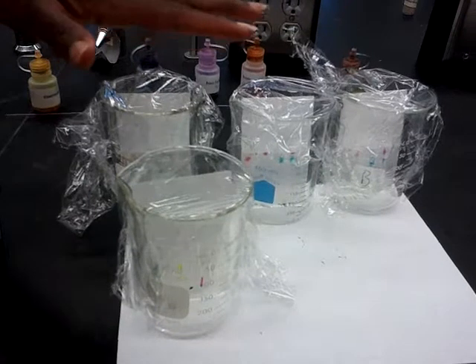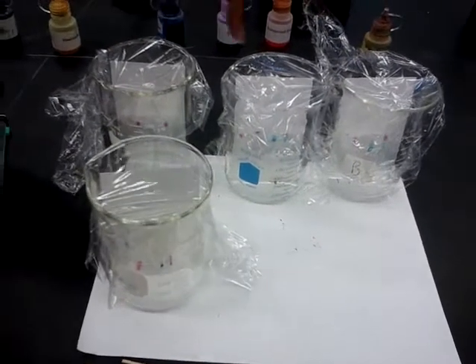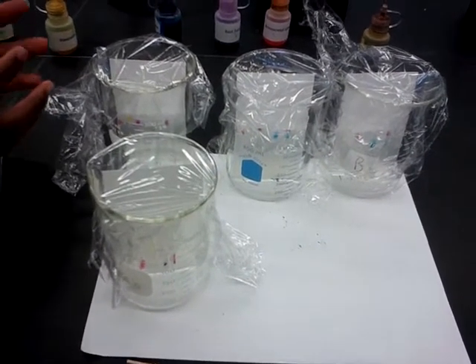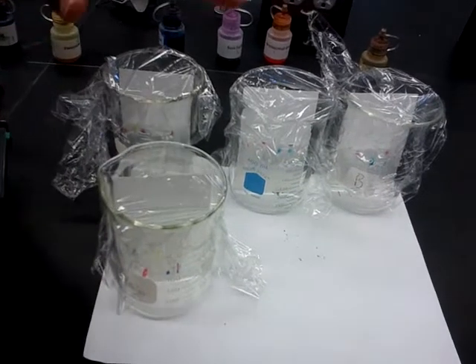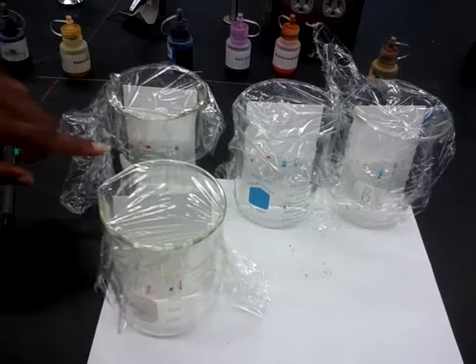So what's going on here on a molecular level, the different dyes are used as the analytes. We're separating the compounds in those dyes. Where those components go depends on the polarity.